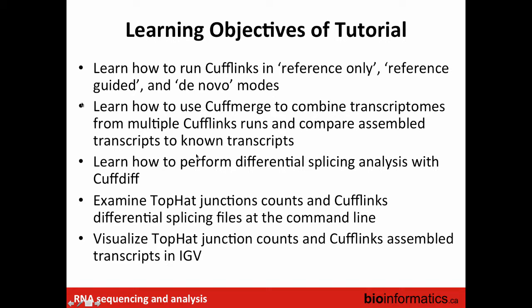In this tutorial we're going to run Cufflinks again but change its mode in two different ways. We've already run it in reference-only mode, but now we'll run it in reference-guided and de novo modes. The commands are very similar — the only thing changing is how we utilize prior knowledge of transcripts. When we ran Cufflinks already, we supplied a GTF file and said please use that information very seriously.